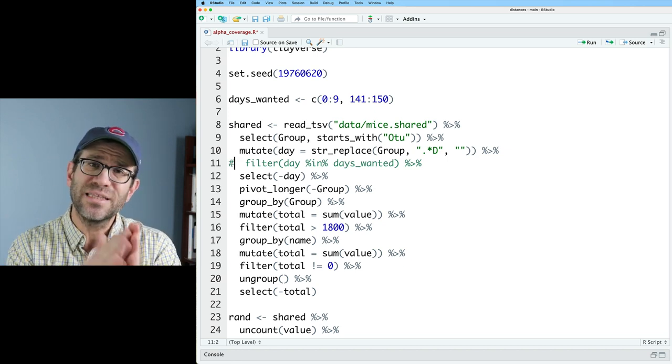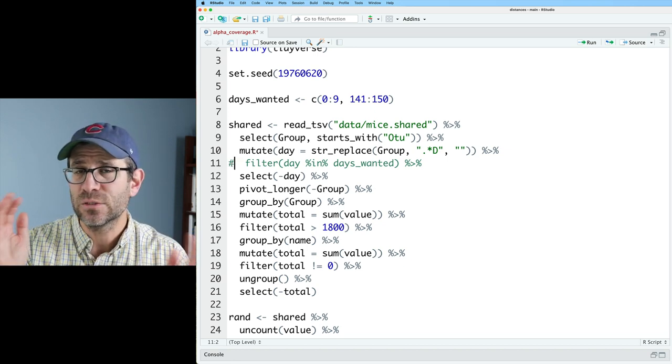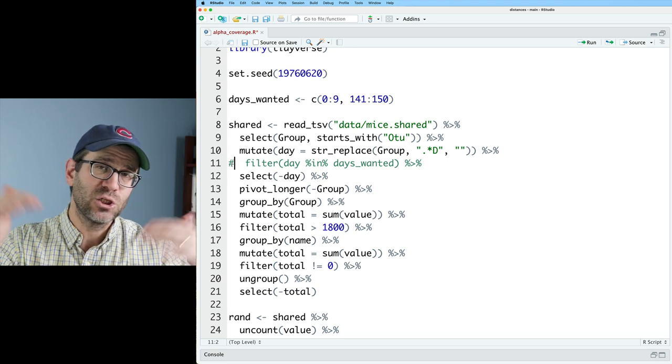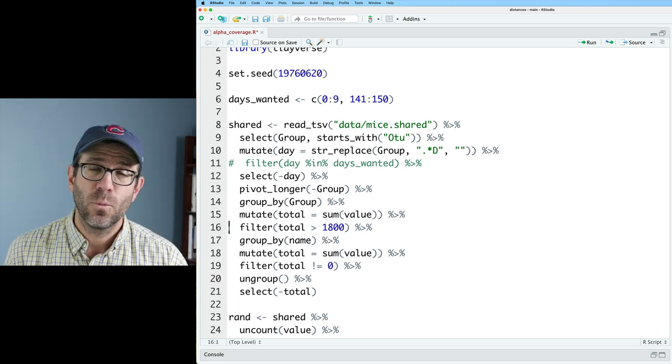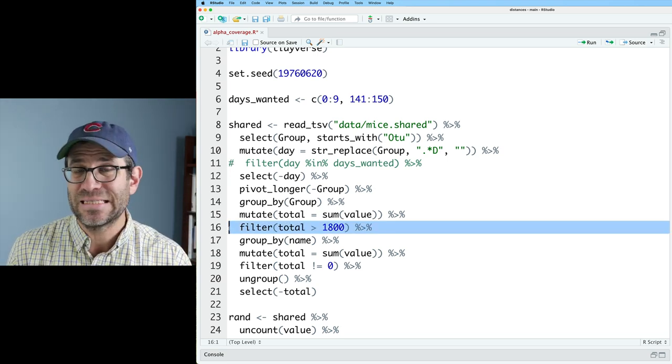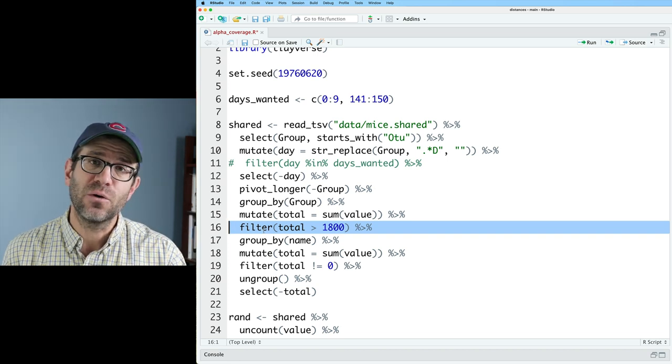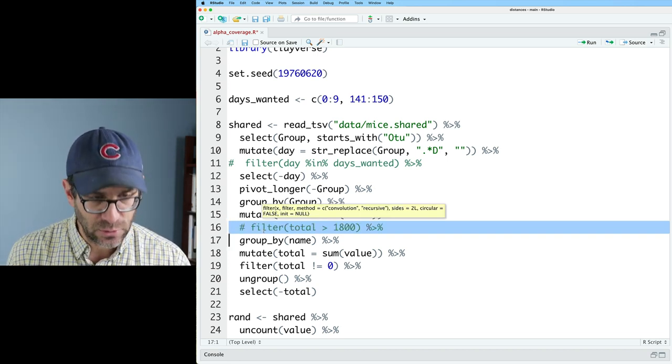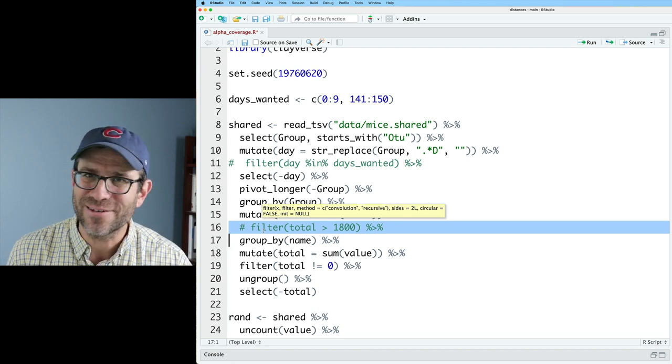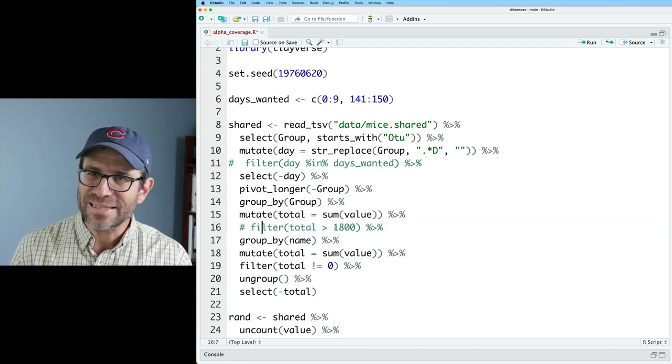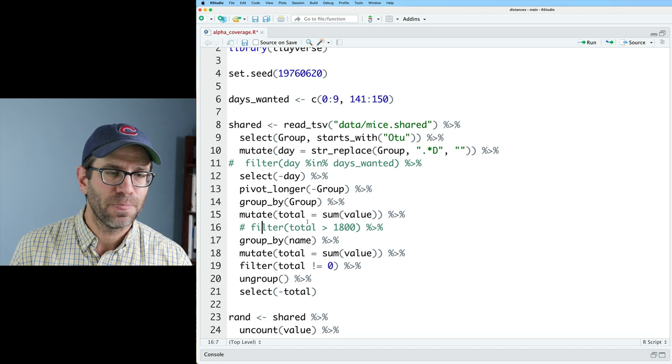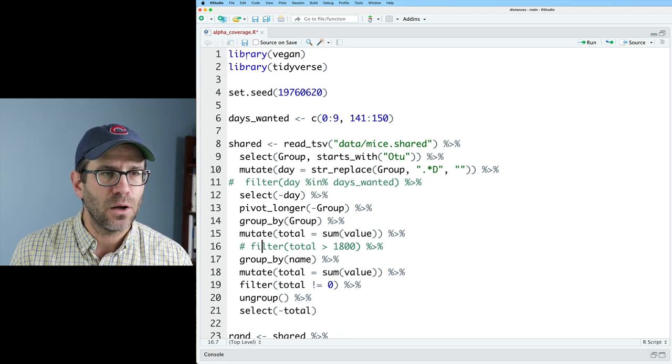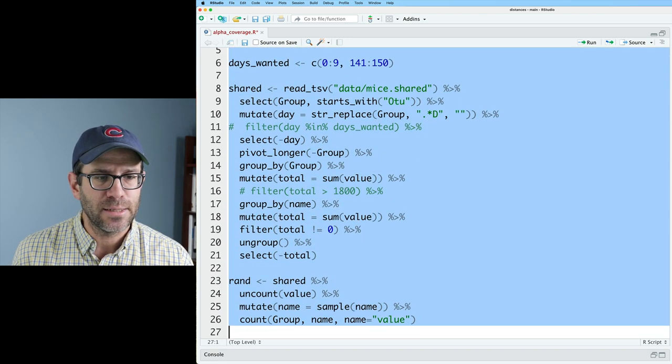We also collected other samples in between those points so we could figure out where the shift in the community occurs. We also have this filter line on line 16 where we filter out any sample that contains fewer than 1800 sequences. That is what I want to talk about today. Why did I decide on 1800?